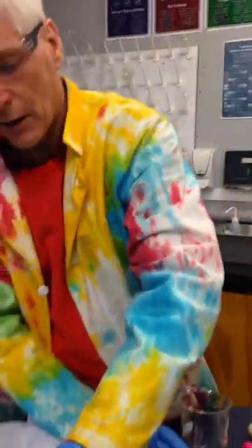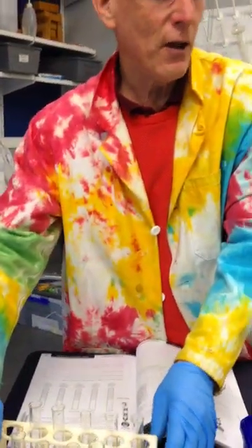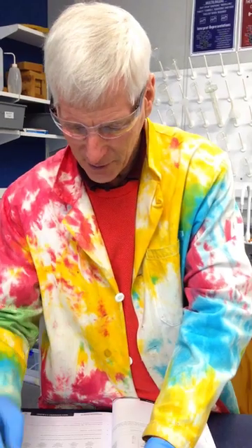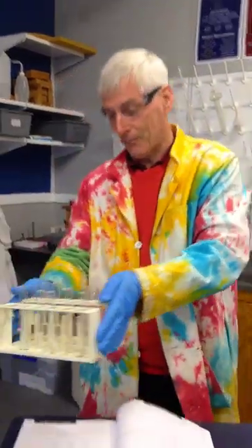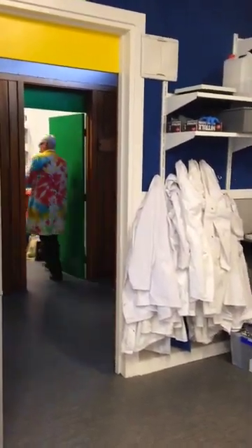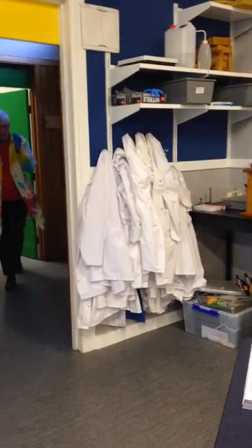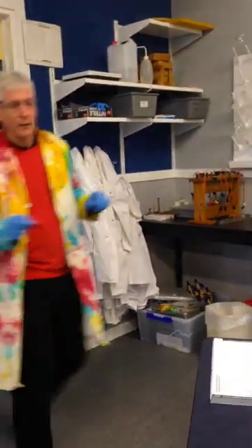I'm just going to exit for a minute. I'm going to put these chemicals in the fume hood. Then I'm going to come back and just finish by doing the electrical conductivity. Maybe I'm not going to be successful in that. Stop it there? No, just keep it going.